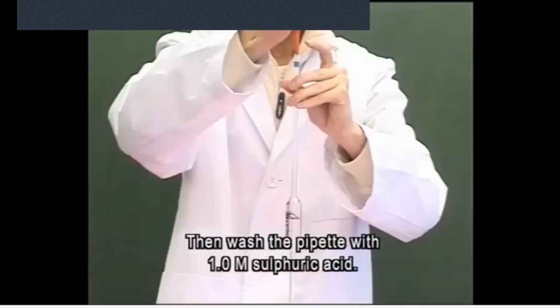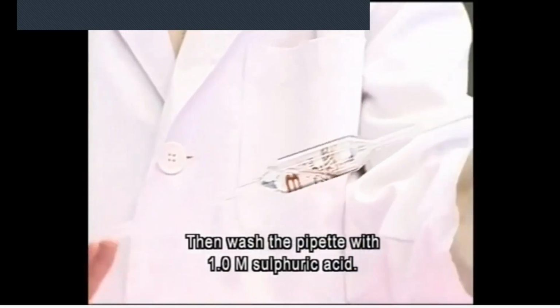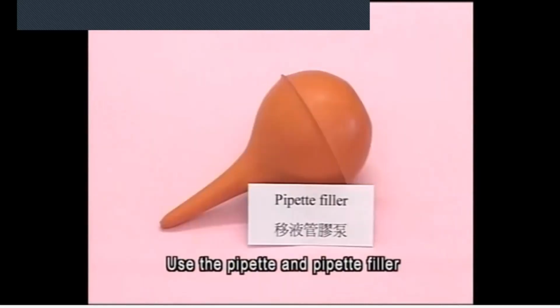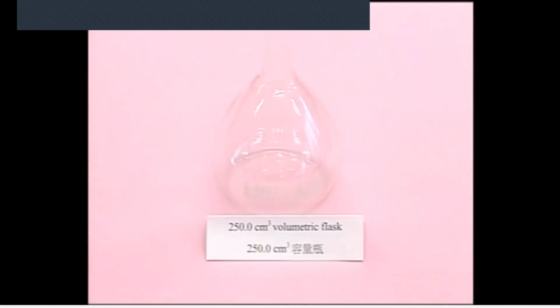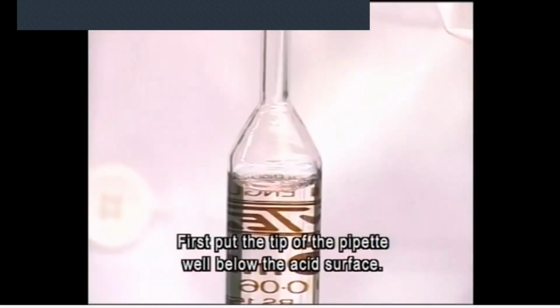Then wash the pipette with 1M sulfuric acid. Use the pipette and pipette filler to deliver exactly 25 cubic centimeters of 1M sulfuric acid into the volumetric flask. First, put the tip of the pipette well below the acid surface.